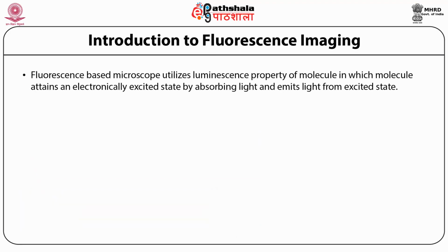Fluorescent based microscopy. The fundamental principle underlying fluorescent based imaging is that we have a sample which is tagged with a fluorescent molecule which has a luminescence property. That means that particular molecule can be excited when it absorbs a specific wavelength and reverts to the ground state when the excitation light is removed, and in that process it emits light with a longer wavelength which can be captured.